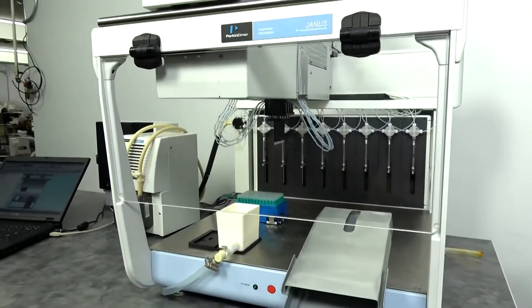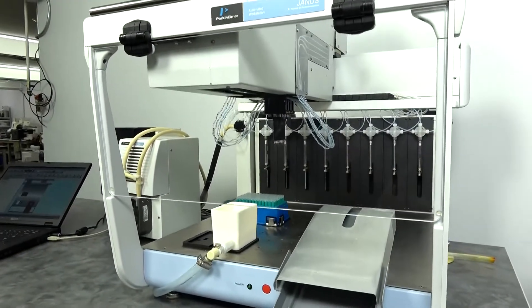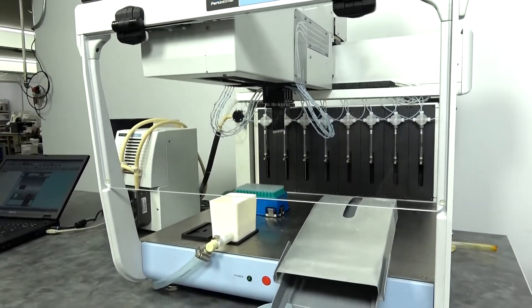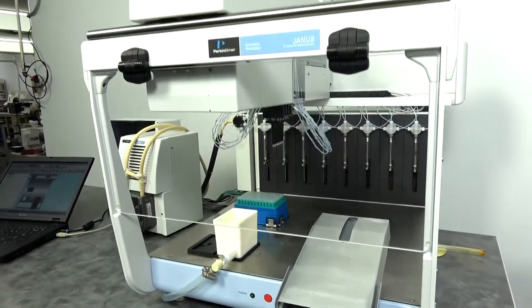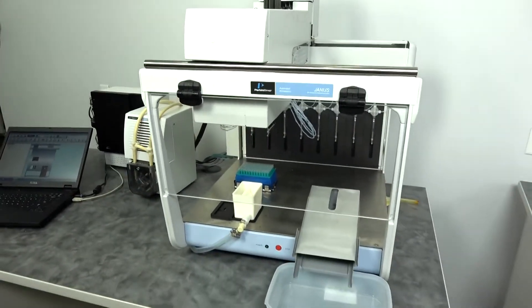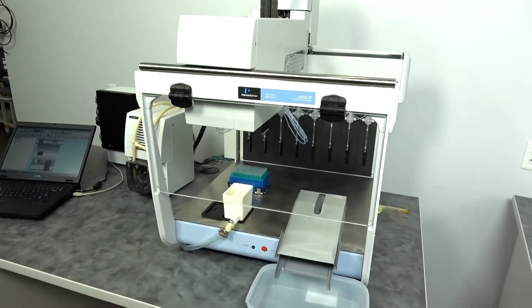The great thing about this is it doesn't take up a lot of space, and it's very precise in both the amount that it dispenses and the placement.